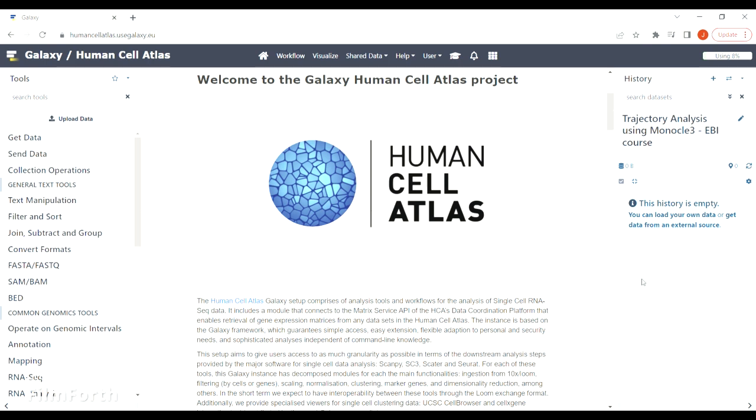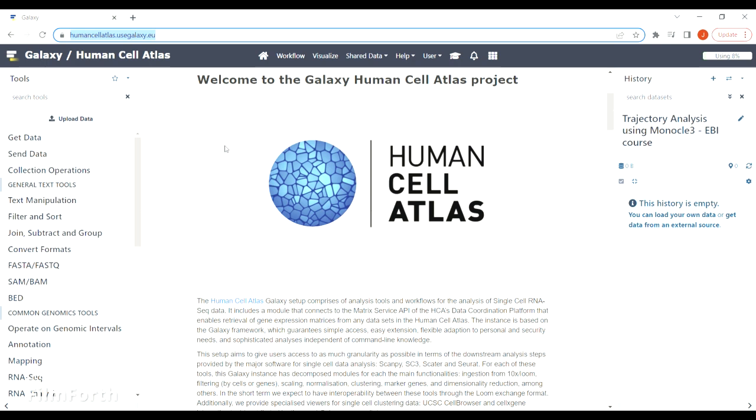I'm using humancellatlas.usegalaxy.eu because it's quite reliable when it comes to searching the tools, but the tutorial should work fine on any Galaxy instance that you're using.